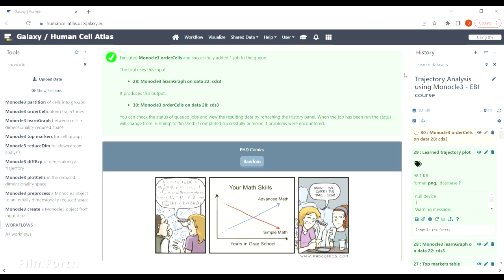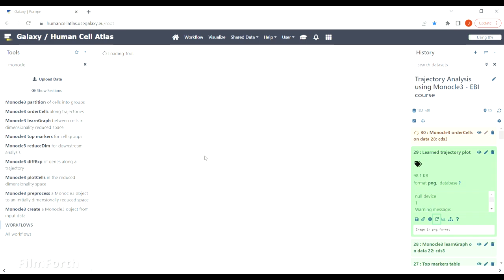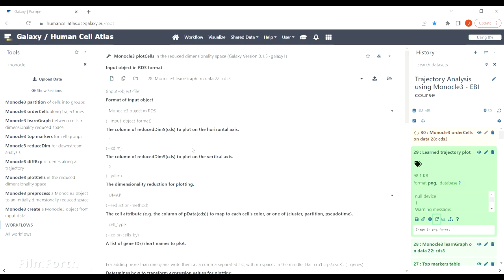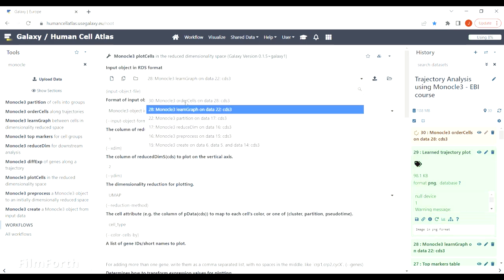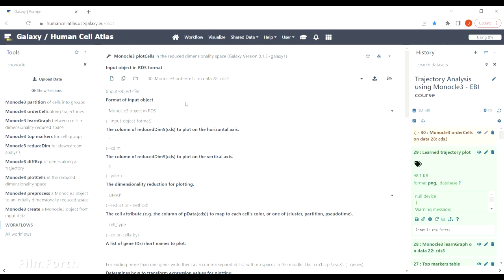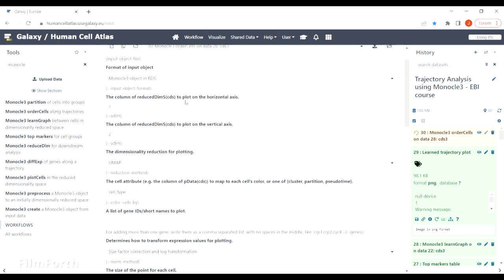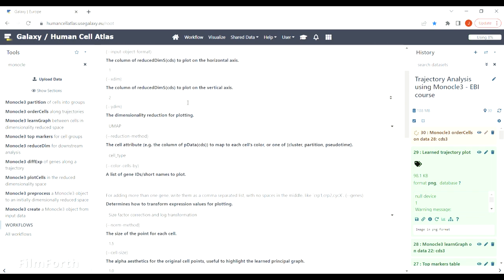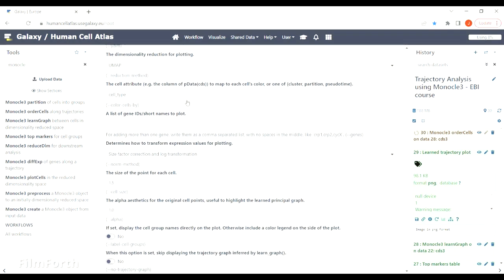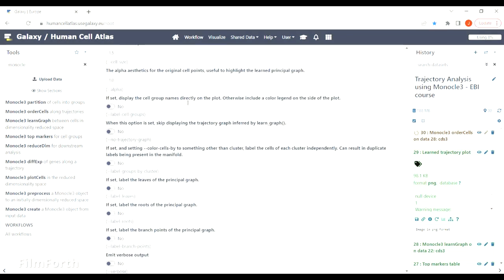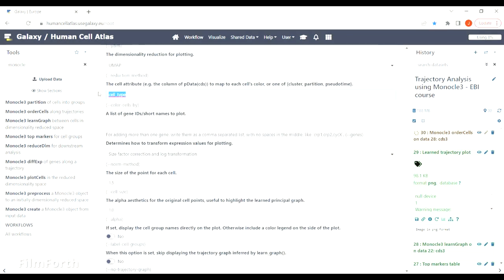Finally, we can generate a plot in pseudotime. Just make sure that your input file is the output of order cells tool and change the cell attribute to pseudotime.